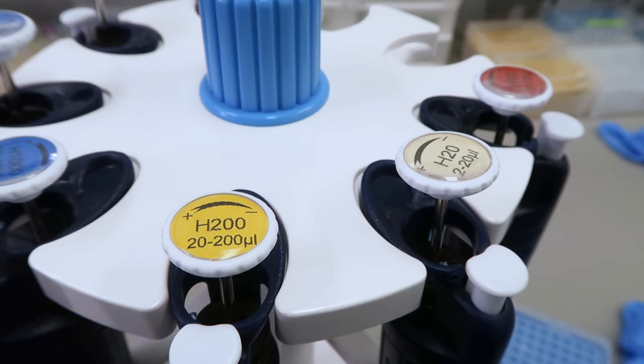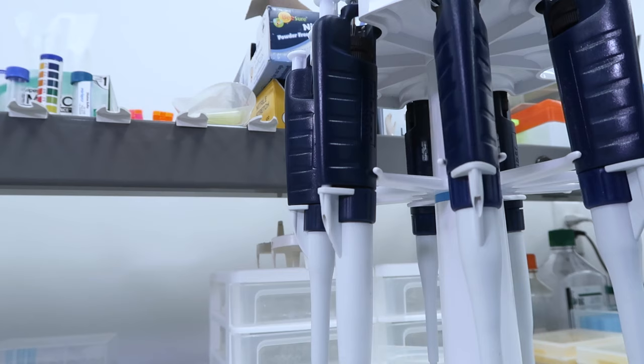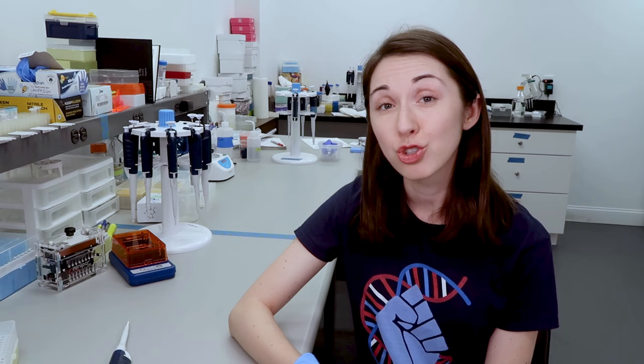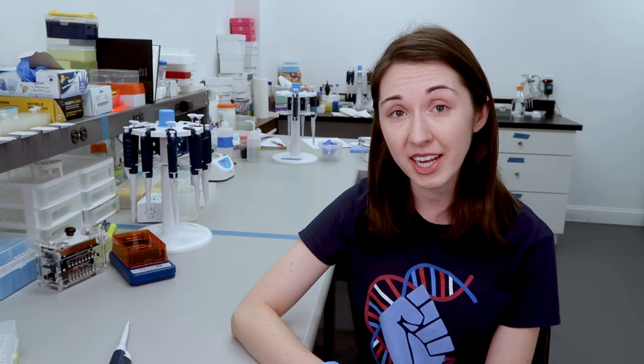You should first make sure that you select the appropriate pipet for the volume you need to measure. For example, the 20 microliter pipet will accurately measure volumes between 2 and 20 microliters. Trying to use a pipet at a volume outside of its range will result in inaccurate measurements and may damage the pipet.